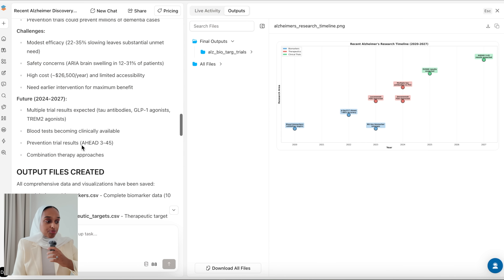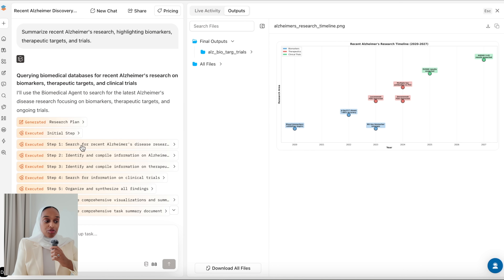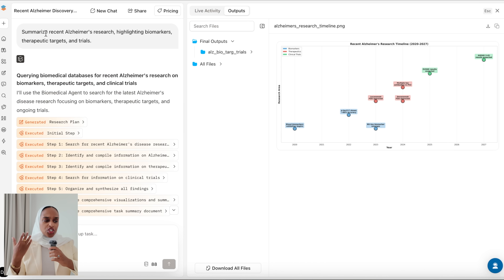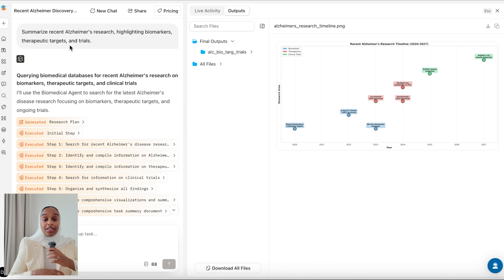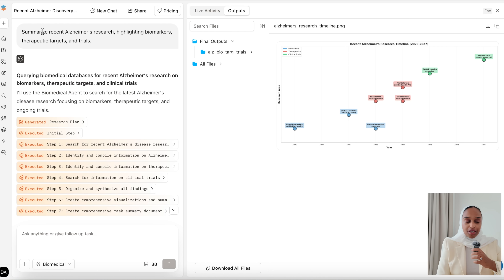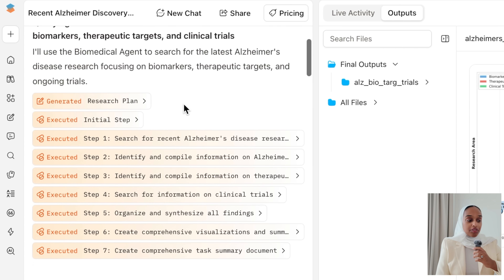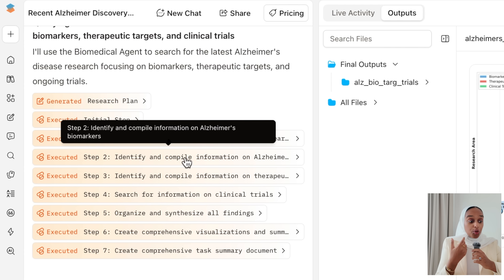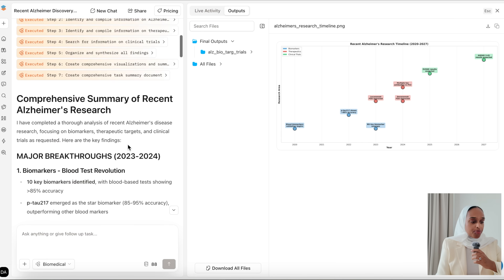I used the same approach for another prompt: summarize recent Alzheimer's research highlighting biomarkers, therapies, targets, and trials. This is quite an open-ended question — I wanted a general summary of recent Alzheimer's research. The biomedical agent used seven steps: looking for research, identifying information, searching for clinical trials, and then creating visualizations and a summary document.